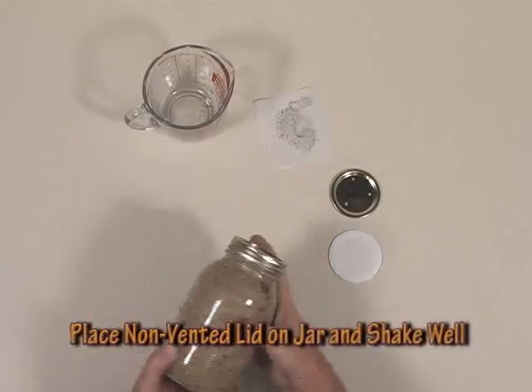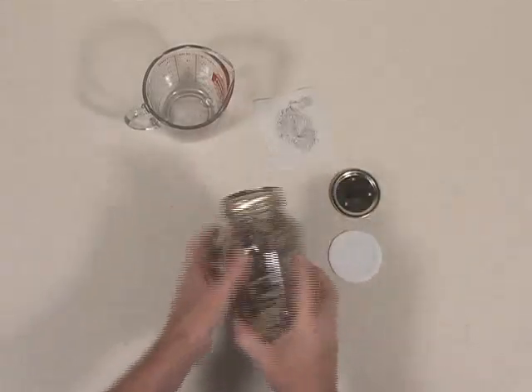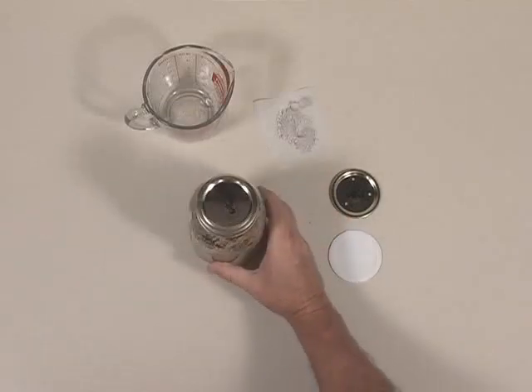Mix that into your grass seed. I like to put a solid lid on the jar — one without holes — and shake it very well, then leave it to sit for a few hours to hydrate the grass seed.